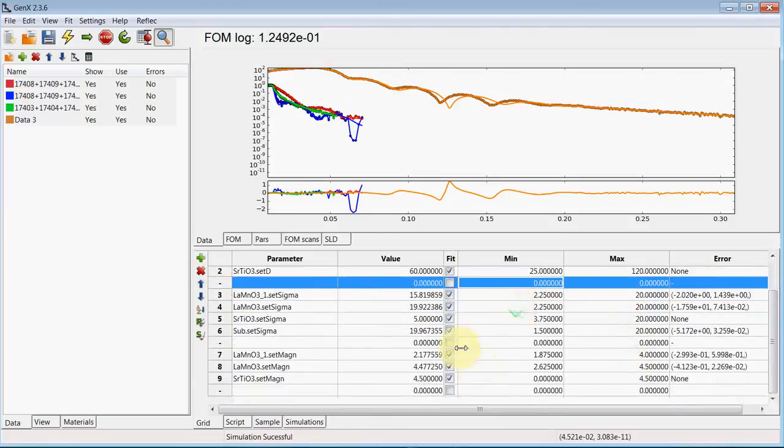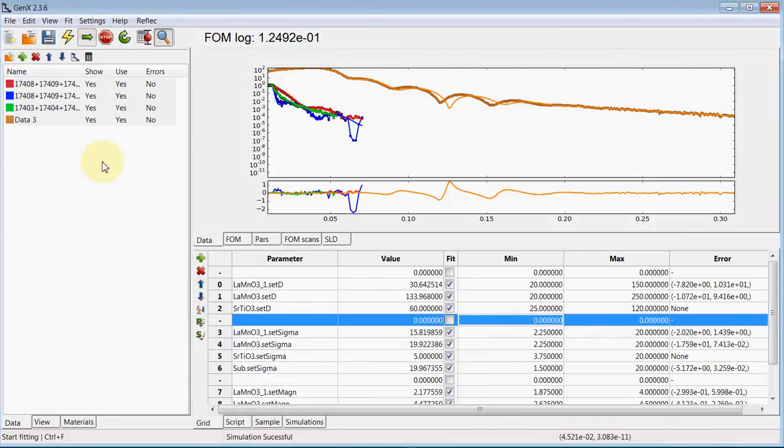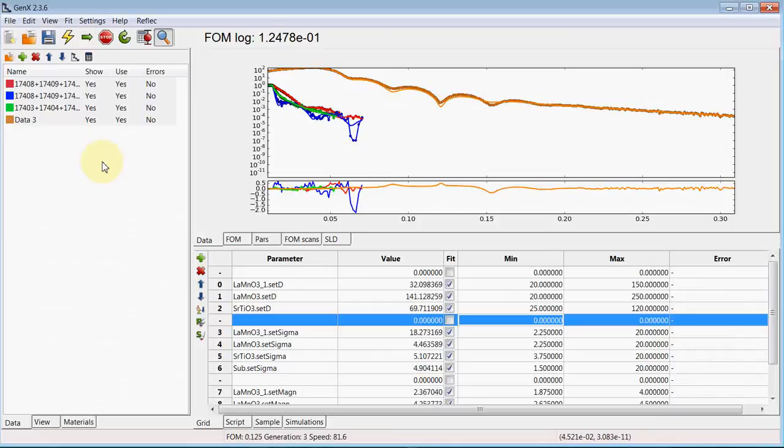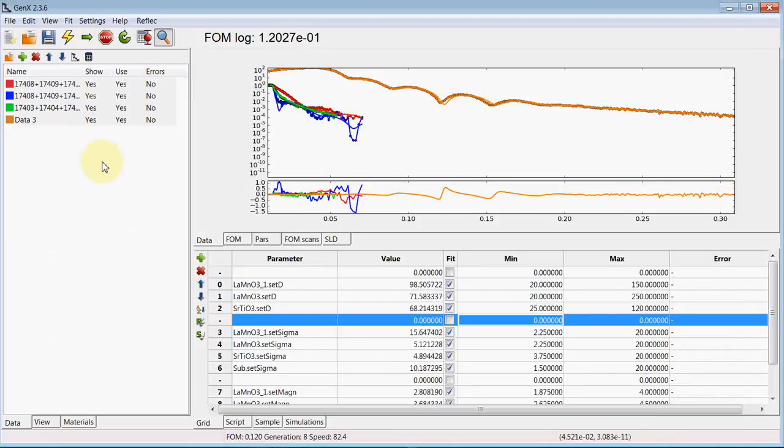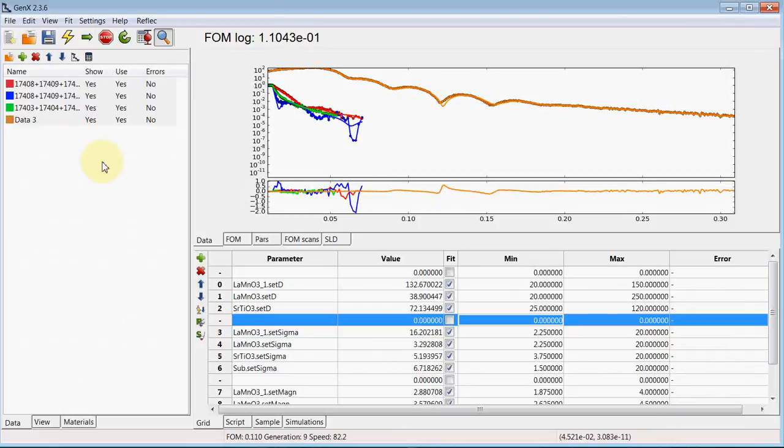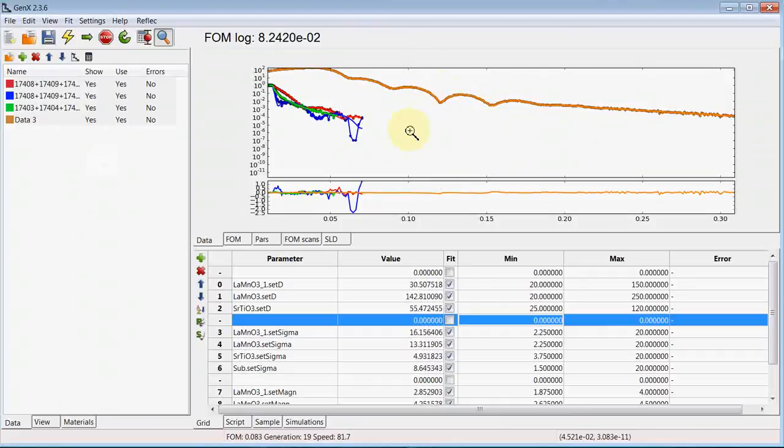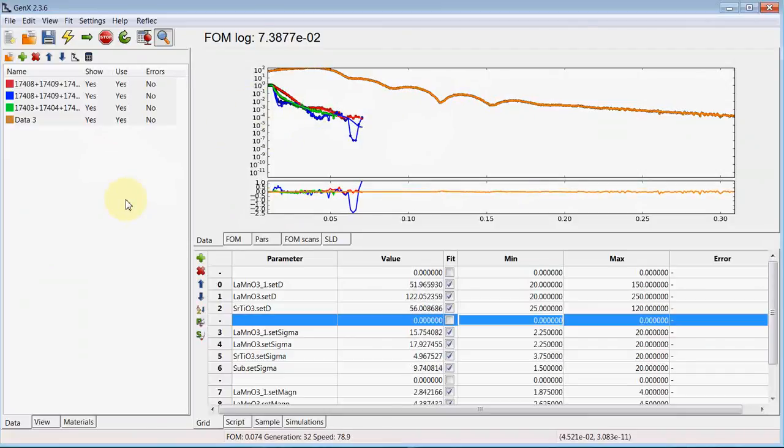Now we can fit both X-ray and neutron data together. As you can see, the X-ray fit quickly approaches the measurement while the neutron data doesn't fit less than it did before.